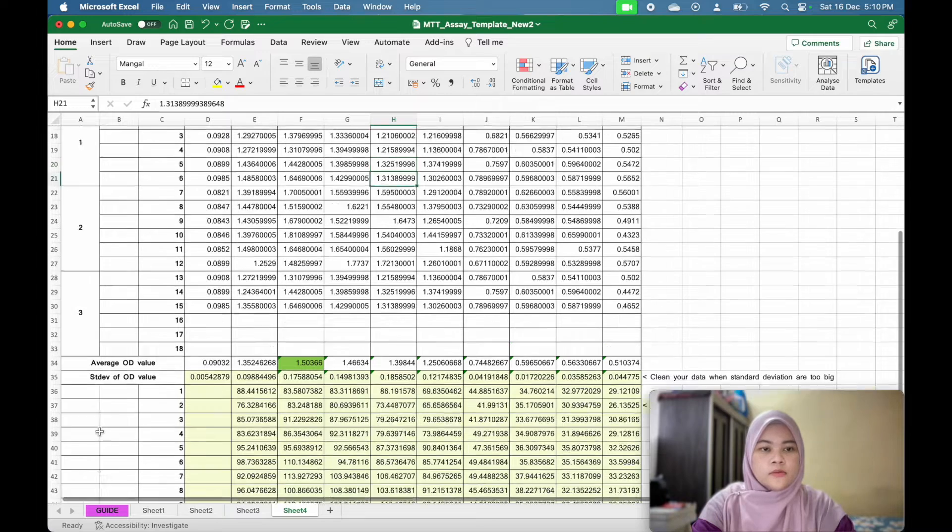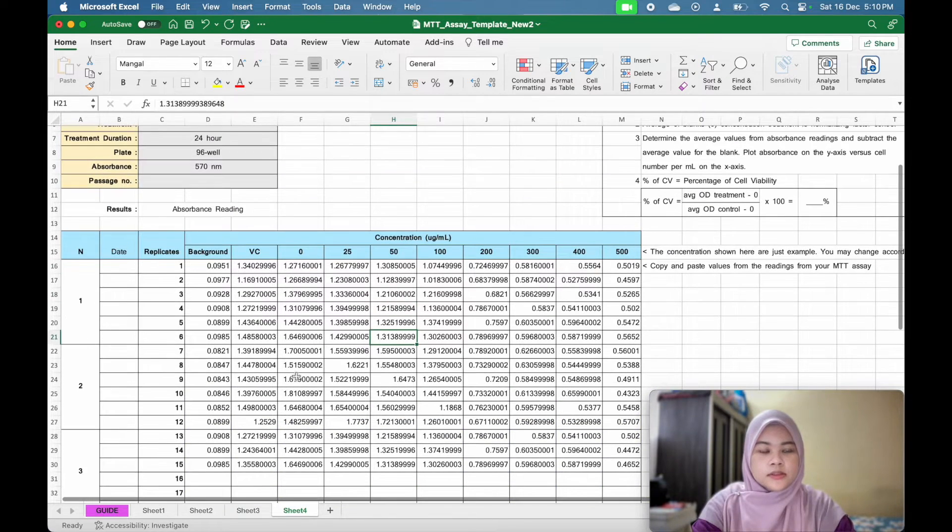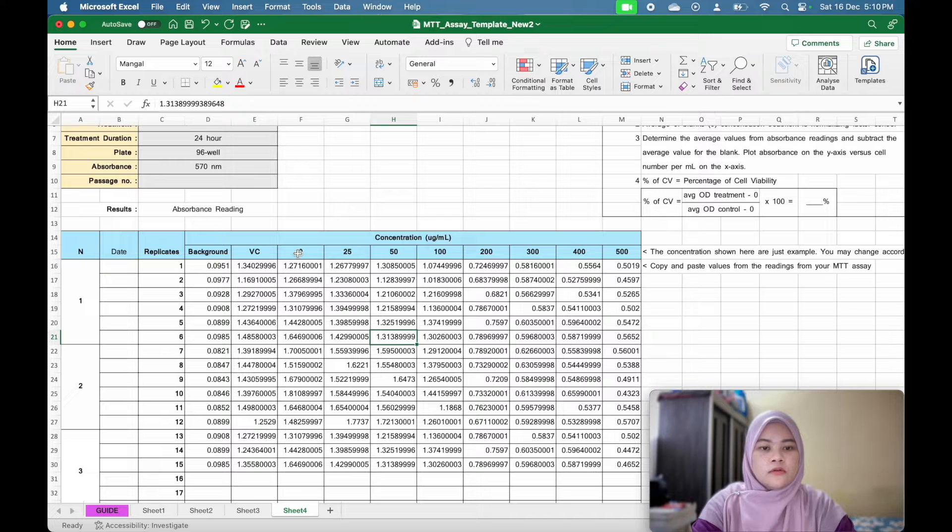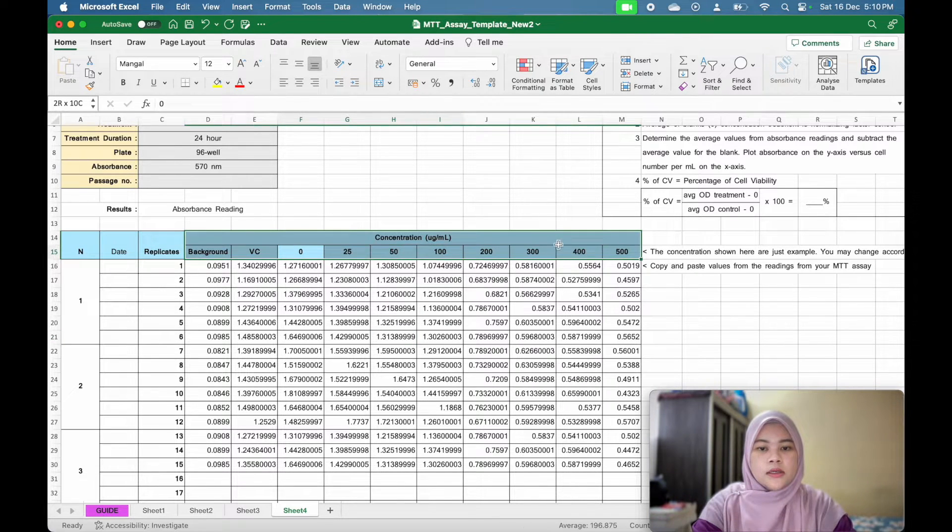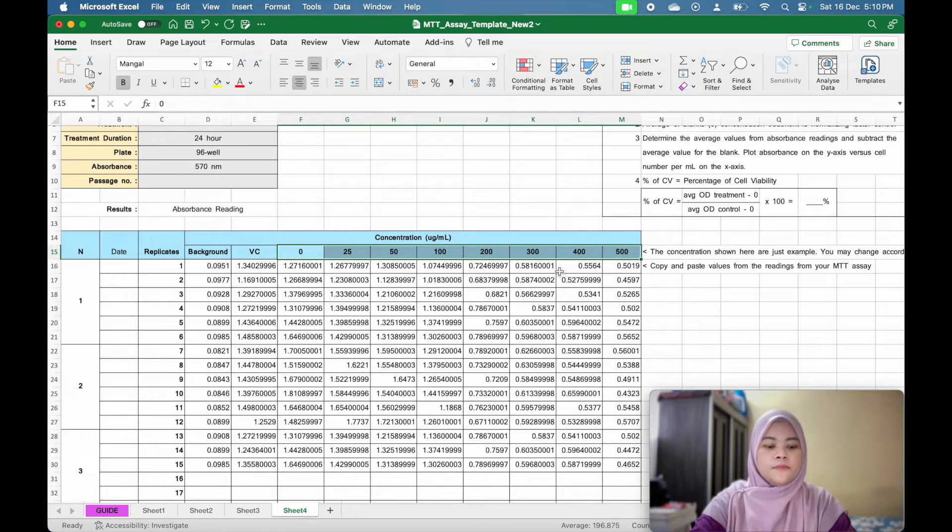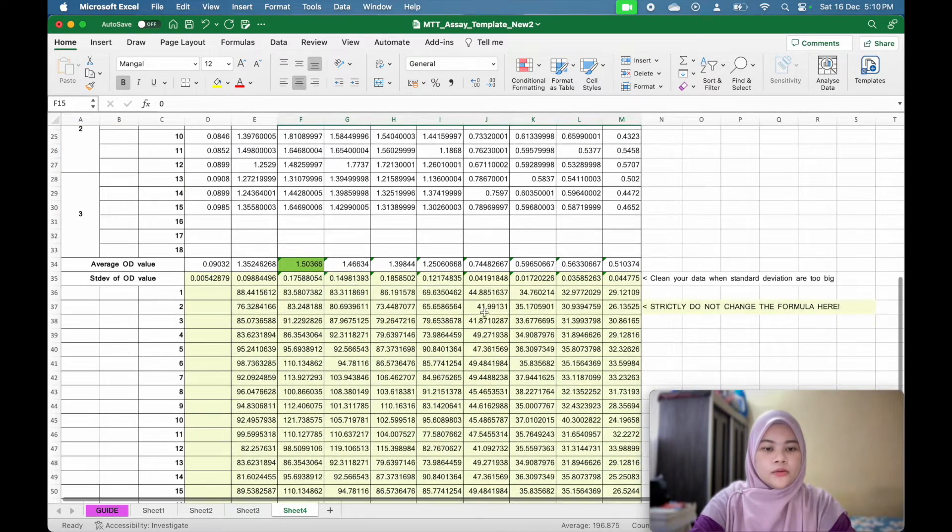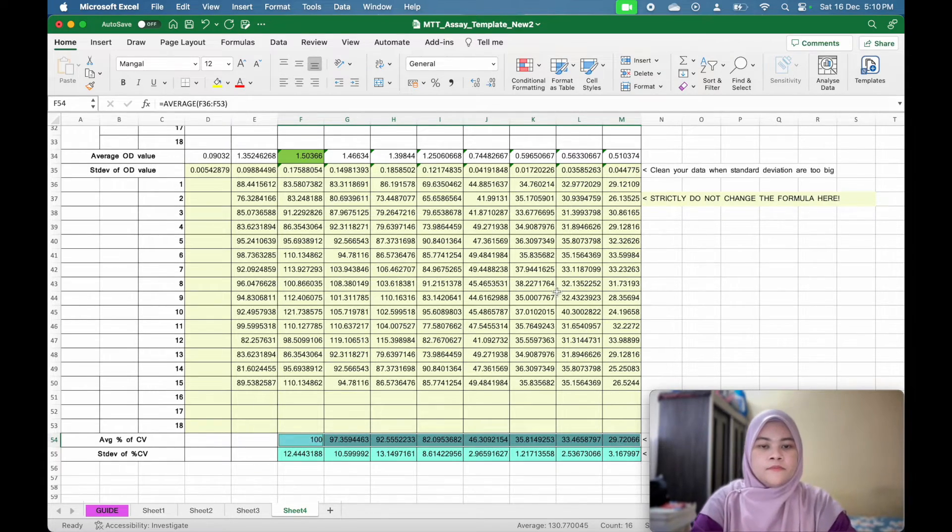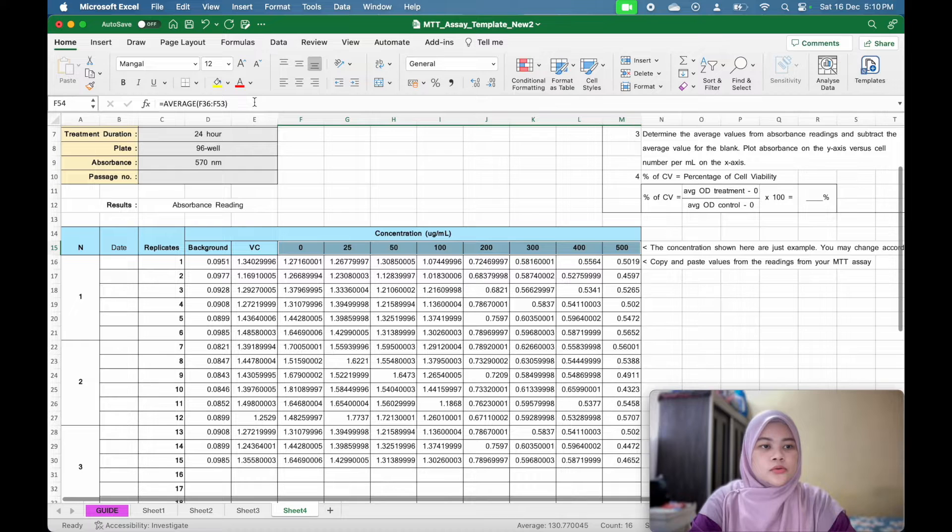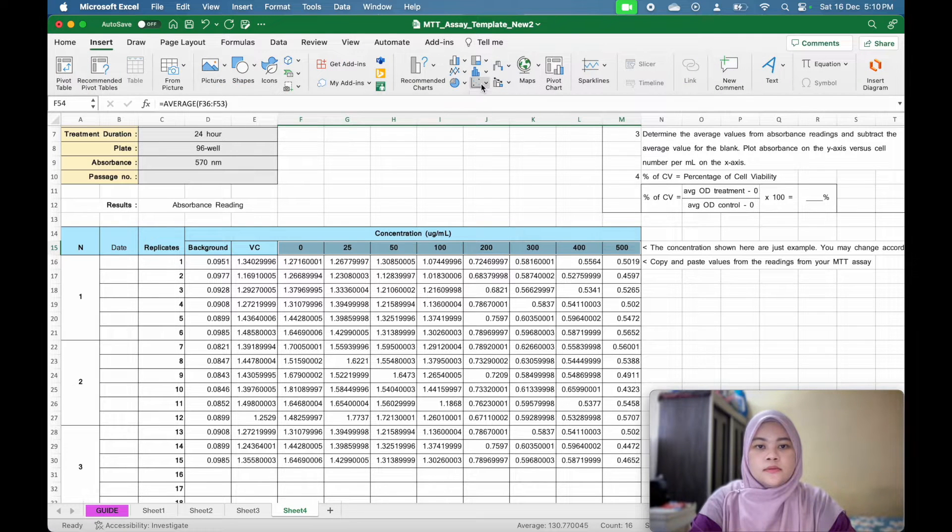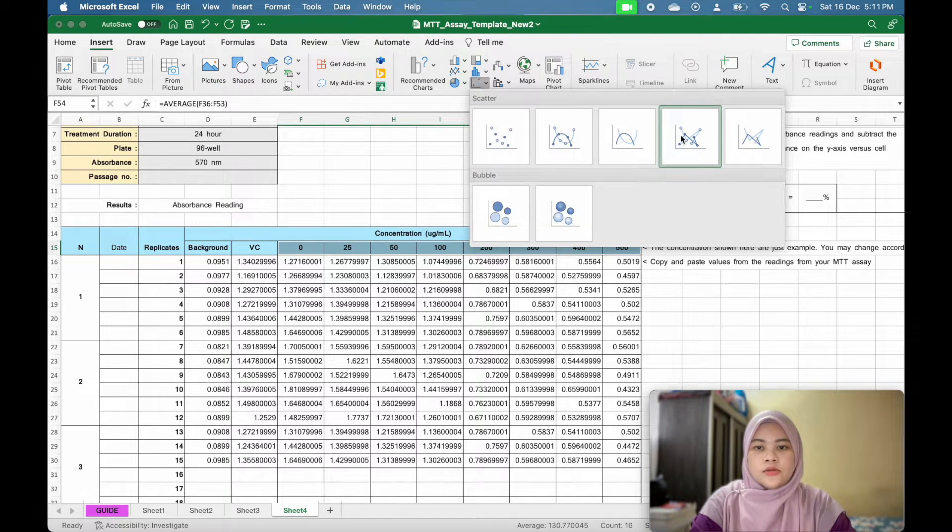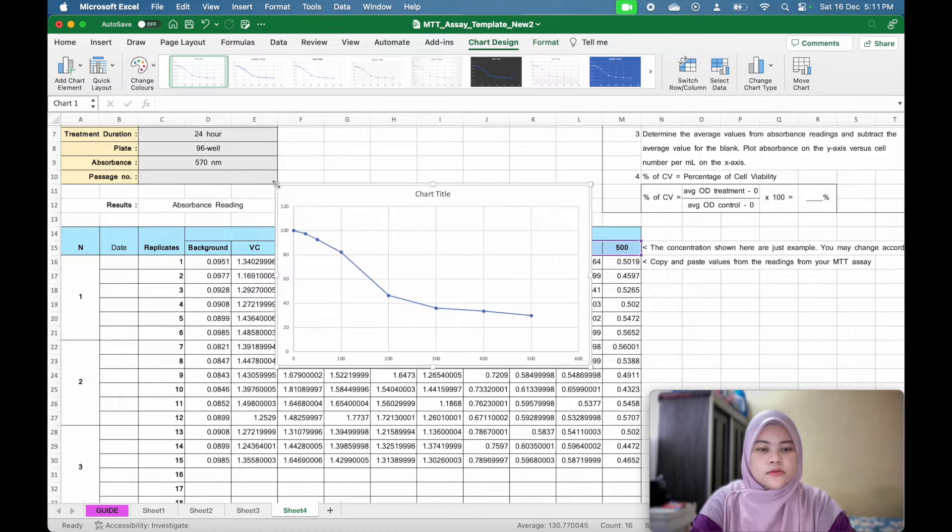So first, I will build the graph. I will build the dose response graph by highlighting the concentration and you click command or control and highlight the average of percentage of cell viability. Now I will go to insert data scatter and choose line graph. Now you get these results.